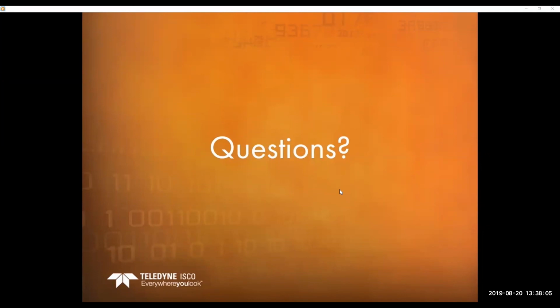Do you have a disposable head or single-use head available for the Reaxis pumps? At this time, we do not. We know that that's becoming more of a trend in the pharmaceutical and protein analysis fields. We do not have a disposable head or something you can click off and toss out. Not to say we're not looking into it. As part of my role, I have to look at all the new technologies and needs of the market. So definitely, it's a good question. It's something that we may consider looking at.